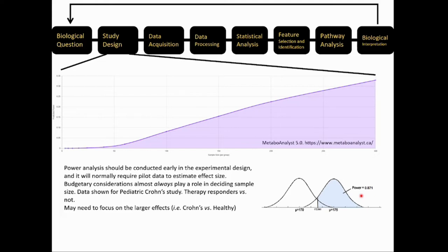But when it comes to metabolomics, things are a little bit more complex because we're measuring so many variables. But there are tools, for example, this is a tool that is built into the MetaboAnalyst package, that is a web-based package that allows you, using some pilot data, to calculate how many samples you would need to reach an adequate power.